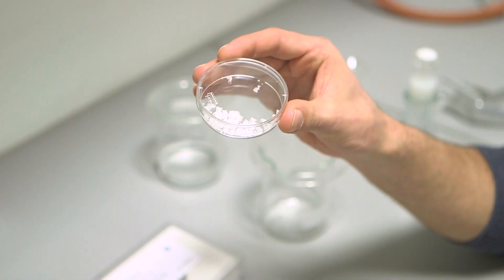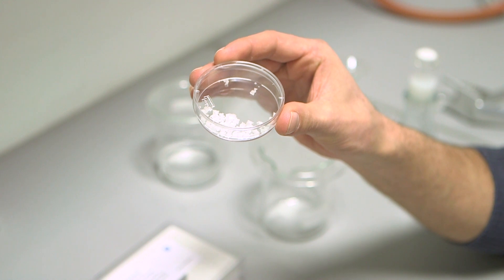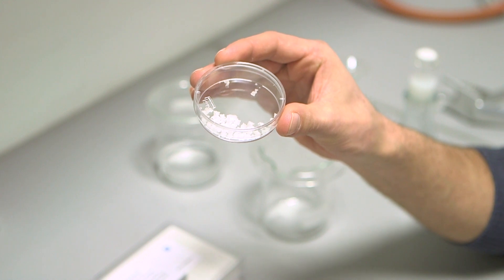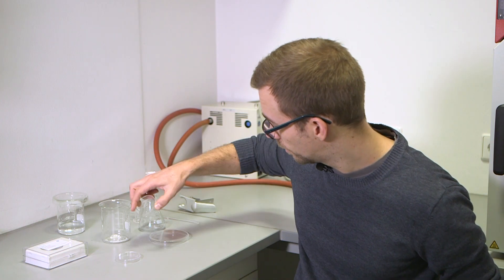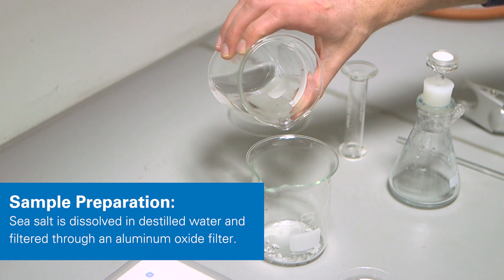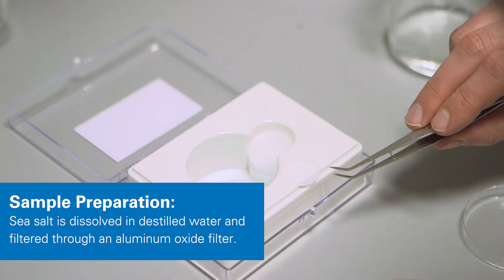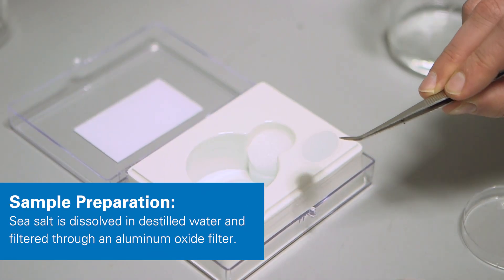We used a sea salt sample and dissolved it in distilled water. Afterwards, it was filtered through an aluminum oxide filter.